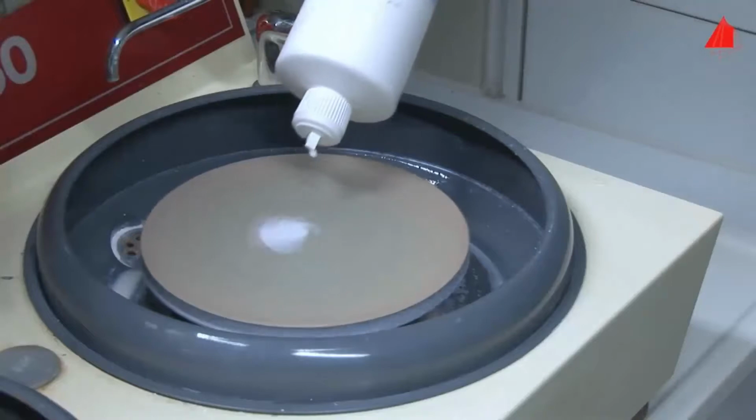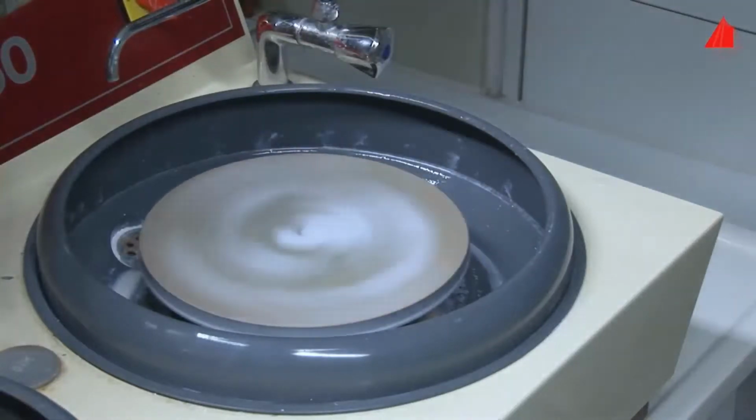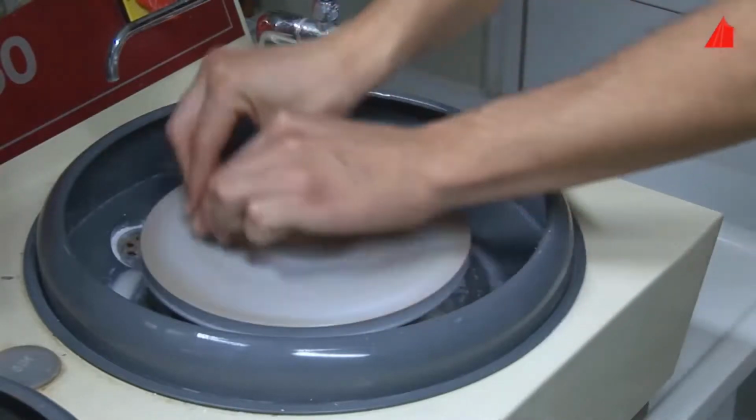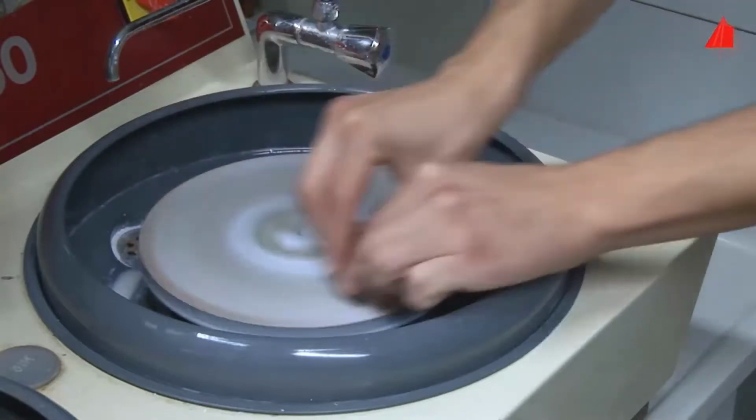Nevertheless, the specimen has to be cleaned again and go through a third and final polishing operation. This time, 50 nanometer aluminium oxide abrasive is used. Only then is the surface prepared to a sufficient quality.